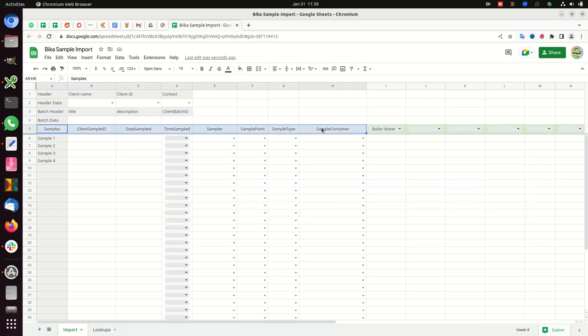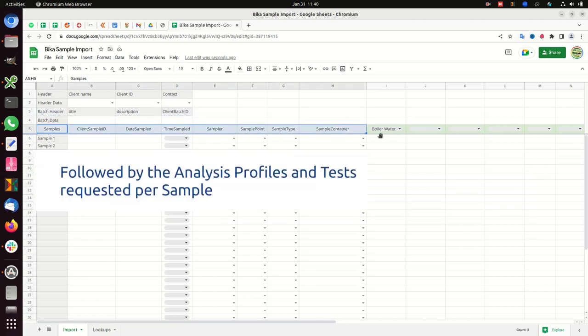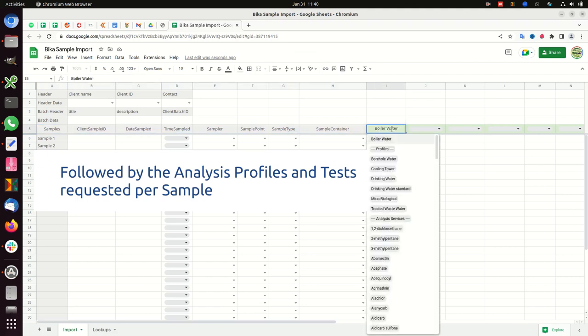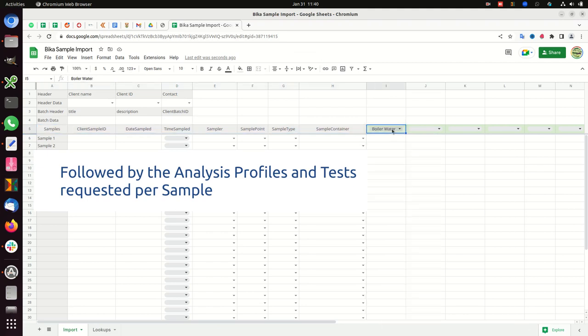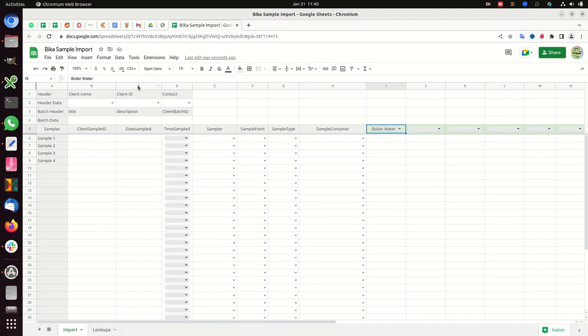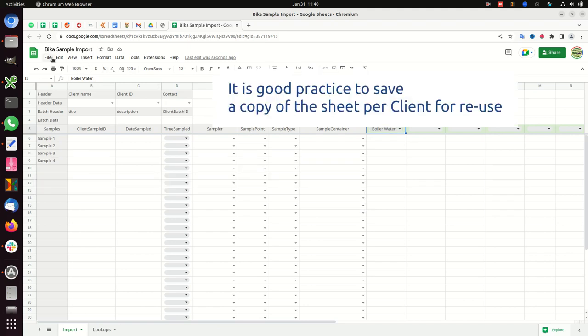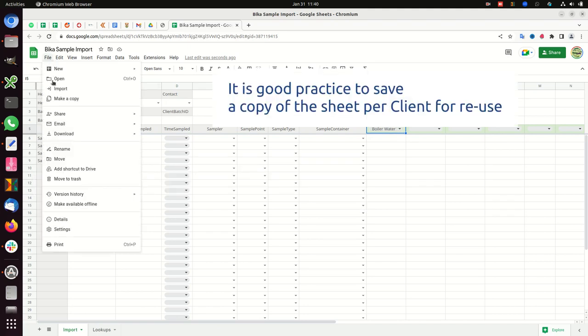Followed by the analysis profiles and tests requested per sample. It is good practice to save a copy of the sheet per client for reuse.